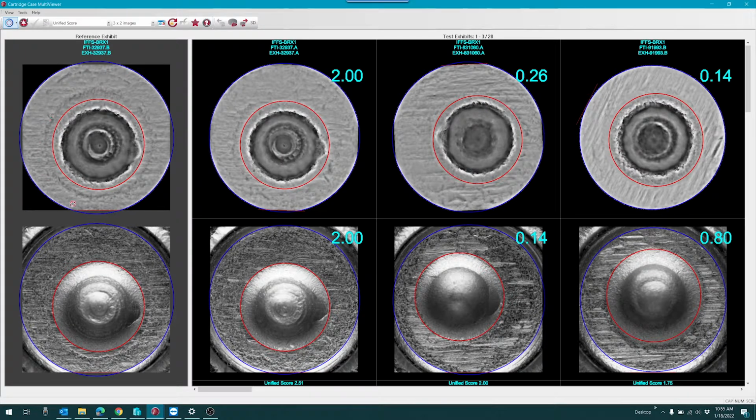And that is a very powerful image to work with there. When you get used to the view of what that depth grayscale looks like, big bold features appear as either white or black marks there, and you can see that right in the firing pin impression as well. When you get used to what this image looks like, it is actually a very, very strong image to work off of to see where those similarities really jump out at you. So I would probably leave it like this.